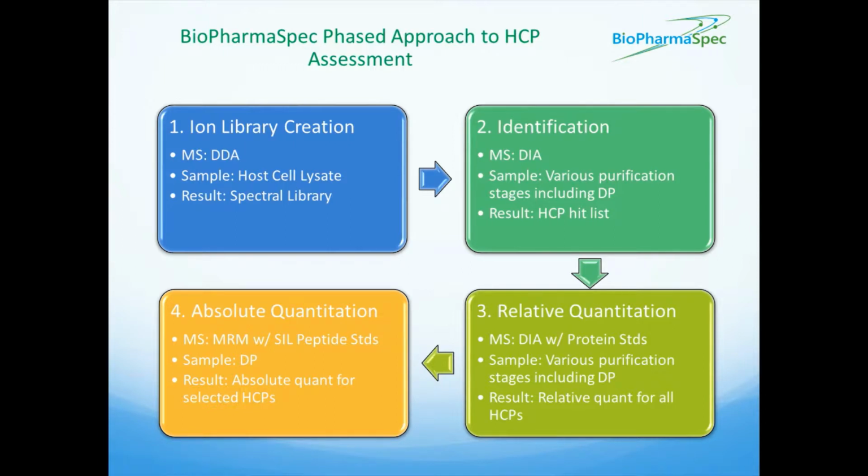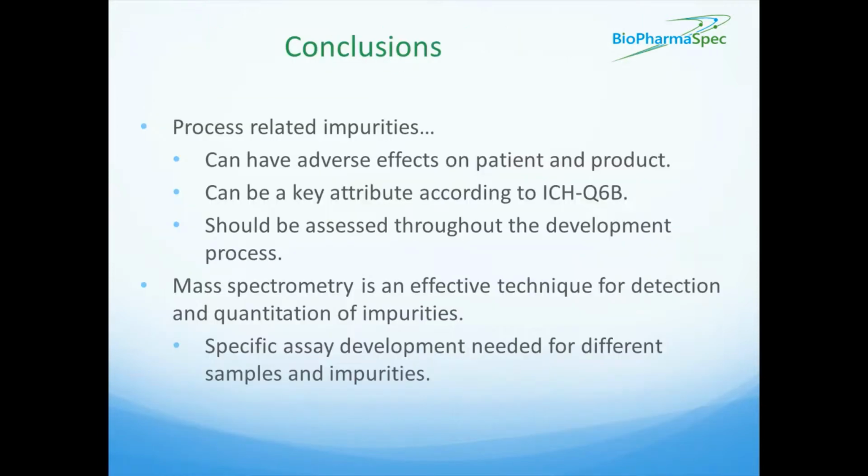At each phase, the method or the instrument that's applied is specifically selected to address the current goal of the phase. I'd love to tell you all about this process in more detail, but that would take considerably more time than I have here today. If you're interested in learning more about our host cell protein analysis approach, we actually have an hour-long talk devoted entirely to host cell protein analysis on our website, and I strongly encourage you all to check that out.